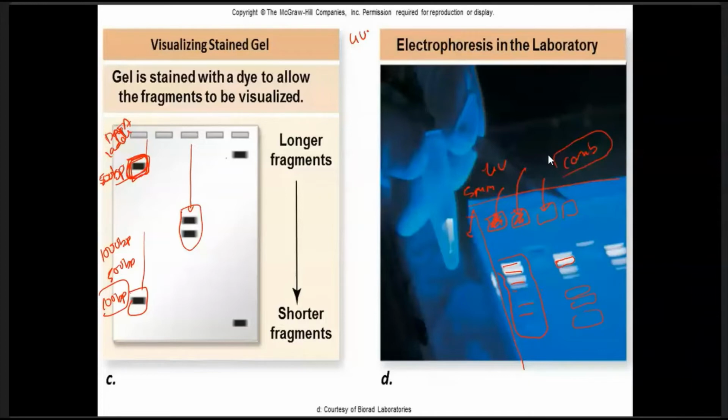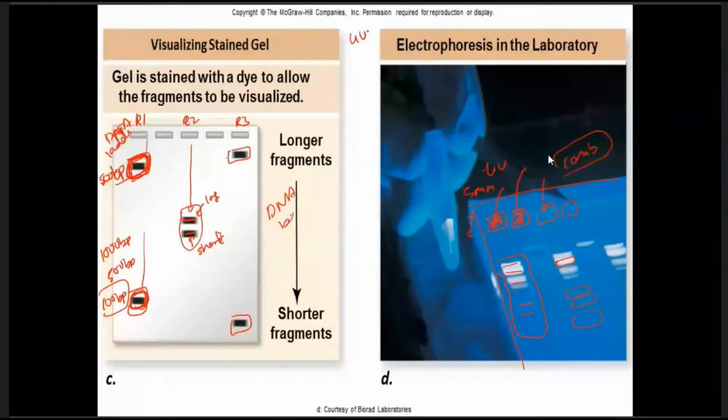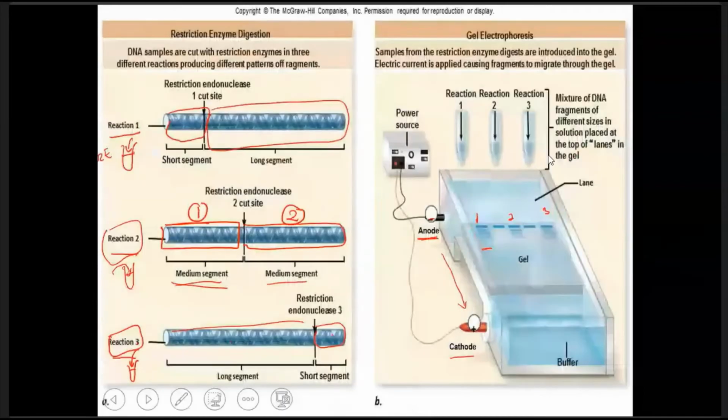So you compare the DNA bands you observe with the cut using the enzyme in the previous slide, this slide here. So you just compare.